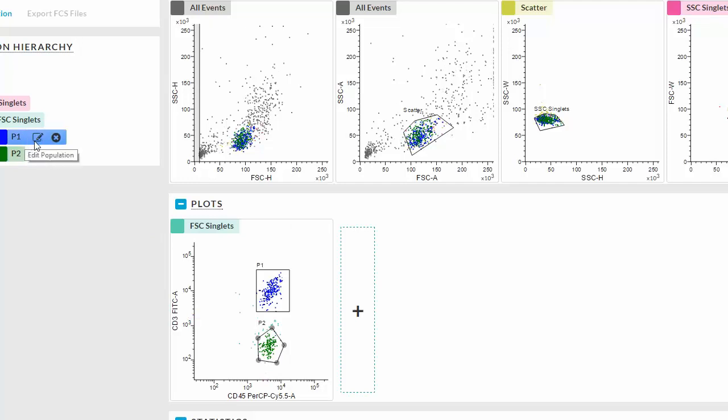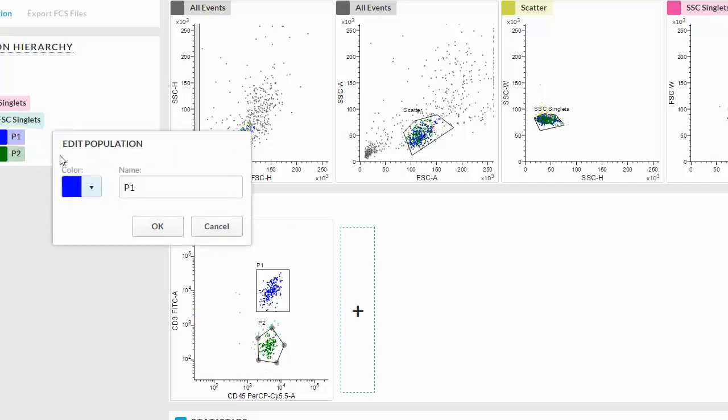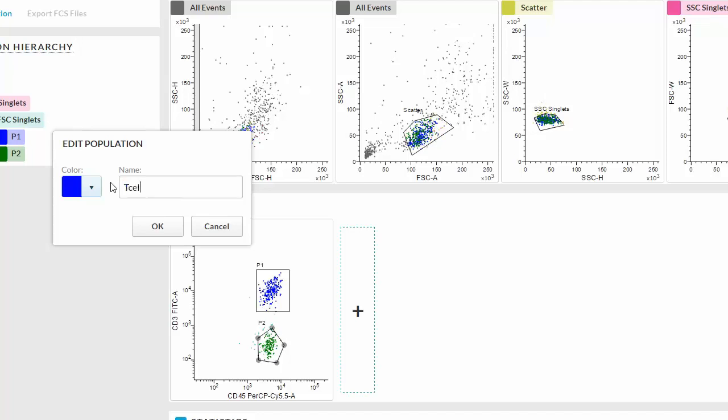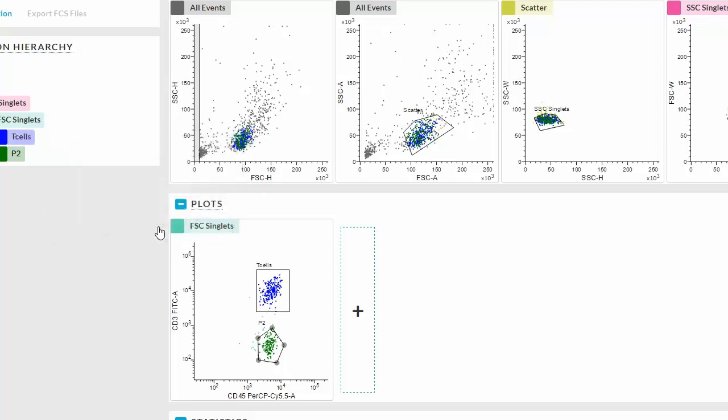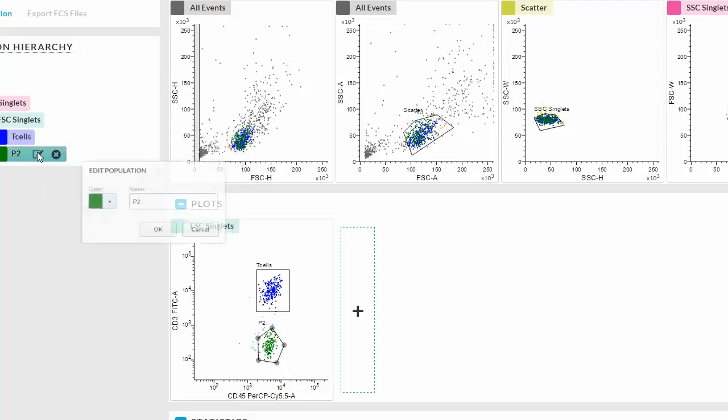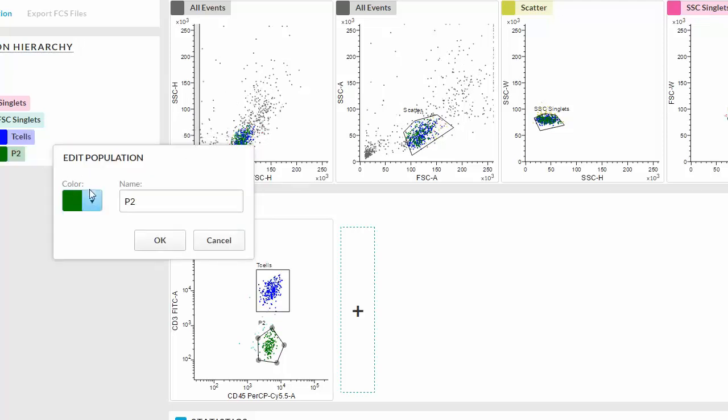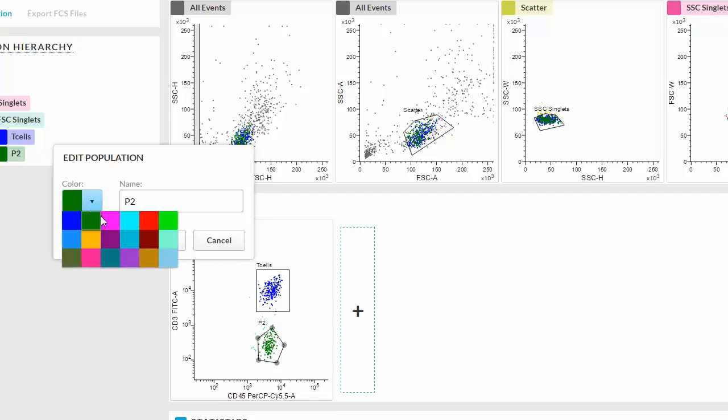In this example, let's create two gates and name them using the population hierarchy. You can change the color of the population by clicking on the pull down menu.